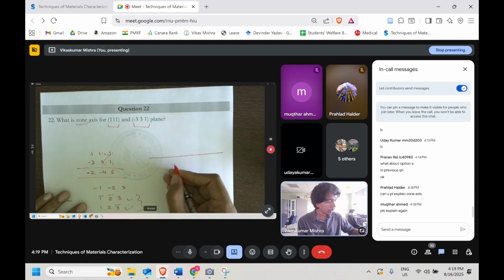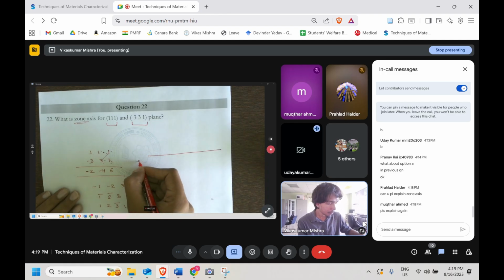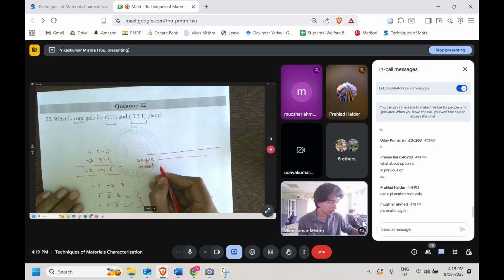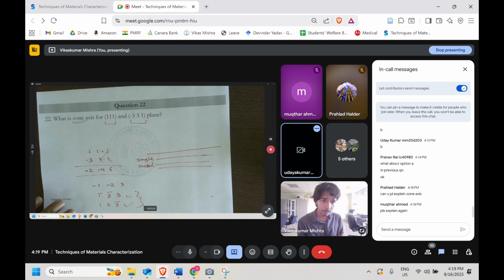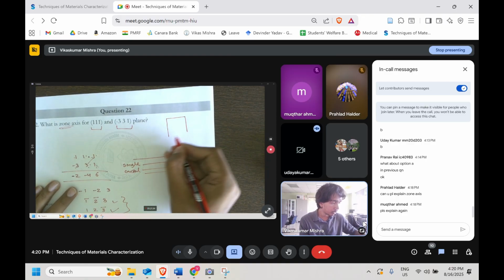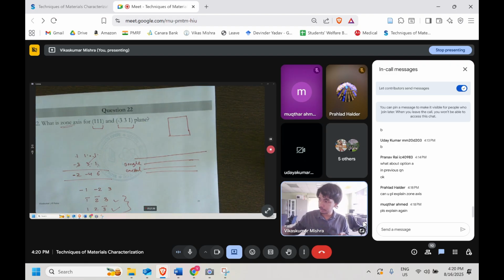Okay. So now let's say our specimen is a single crystal. They will have a certain particular orientation. Atomic planes will have a certain orientation, right? So, for example, let's talk about a particular case. Let's say we are talking about the cube. Better I take the bigger page.